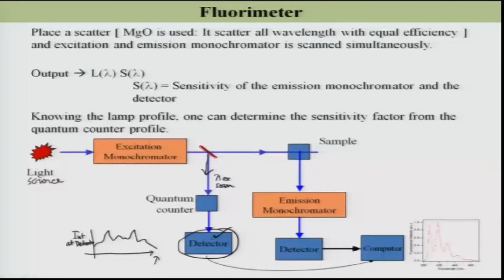So, I was discussing this quantum counter. In this quantum counter my aim is to get the characteristic emission spectra, and I was discussing the measurement of the total emission coming out from a substance where the inner filter effect is highest, the complete inner filter effect.